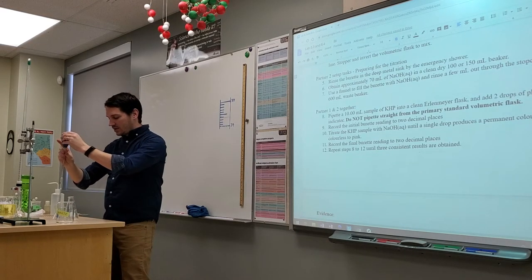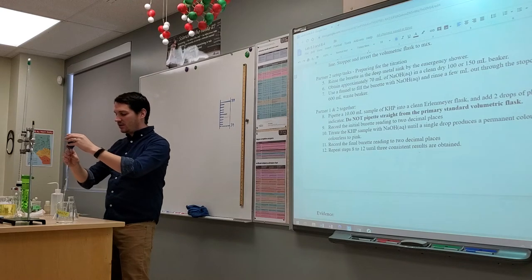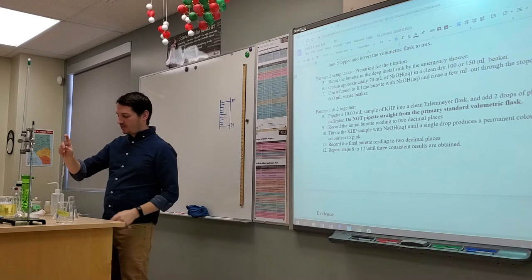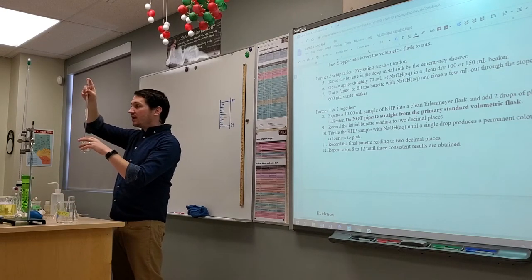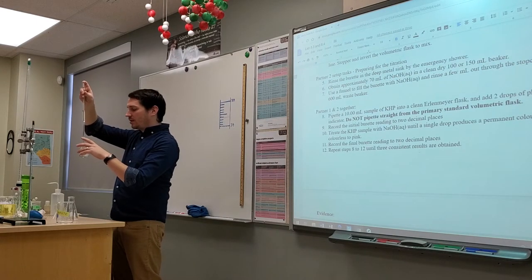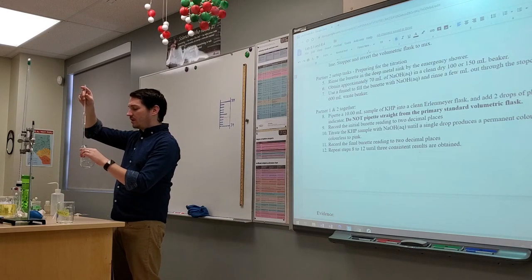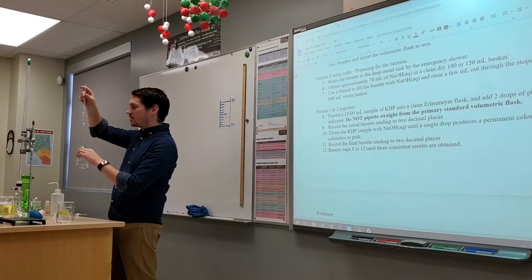So I'm gonna take that, I'm gonna pull it up. Again, you can tap it to the bottom and it really slows down. I'm gonna pull it above the line. I'm gonna cap it with my forefinger. And I'm gonna wait. I'm gonna gently let it go until the meniscus is at the top of the line. Perfect, 10 milliliters, boom, done. I'm gonna wait for it to drain because this is really important. I know we're taking up a lot of time, but it's important for us to walk through this.